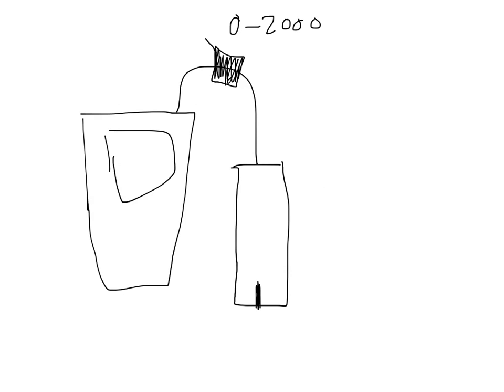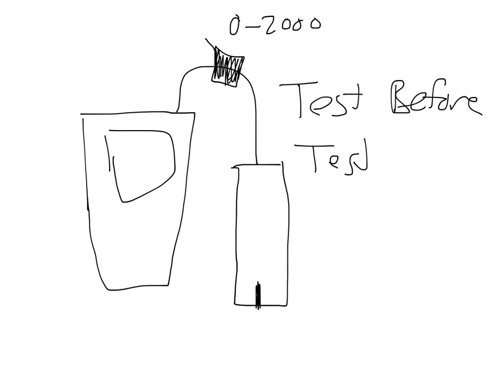Now the video I'm going to show you about the conductivity probe has you keep the probe in there for the entire time. We're not going to do that. You guys are going to do a test before and a test after.